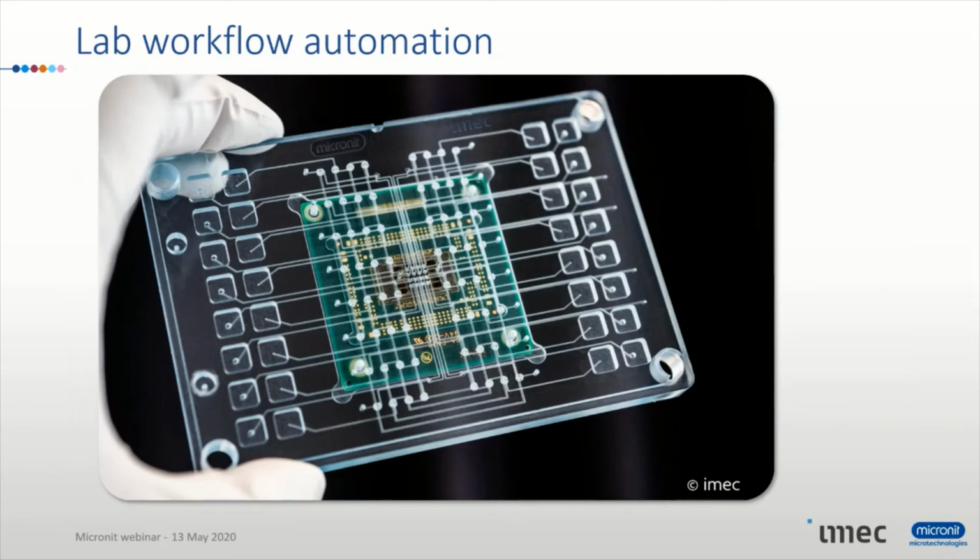Lab workflow automation, as mentioned. This is a nice example of a device where you see a plastic cartridge in a microtiter plate format. It can be accessed fluidically through a robot pipetting into the side reservoirs. The microfluidic infrastructure will take over and will access a silicon sensor in the center area, which could be a flow cell, a multi-electrode array device, or anything else. In this way, you combine these materials and automate your workflow.